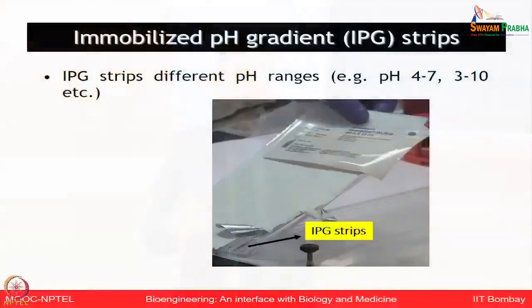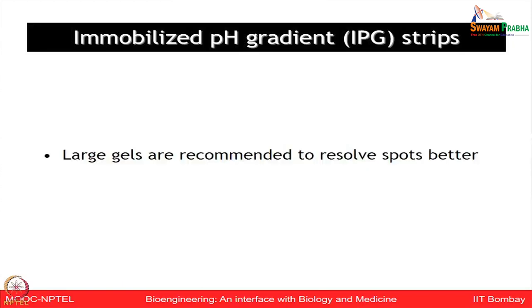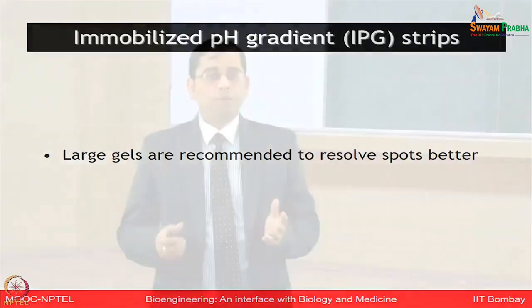So, the very first thing that you want to look into is which kind of immobilized pH gradient strips you can use for doing the protein separation. These are acrylamide based plastic strips on which different pH buffers are coated, and they come in different pH ranges. For example, it can be pH 3 to 10, it can be even 4 to 7, the physiological range, and they also come in different lengths. For example, you can always start with a smaller length of 7 centimeter, but for the actual experiment you can choose a large length of, let us say, 24 centimeter, and your intention is to resolve the proteins on large gels so that you have good separation of various protein spots.